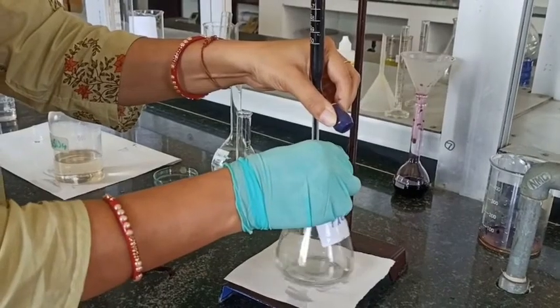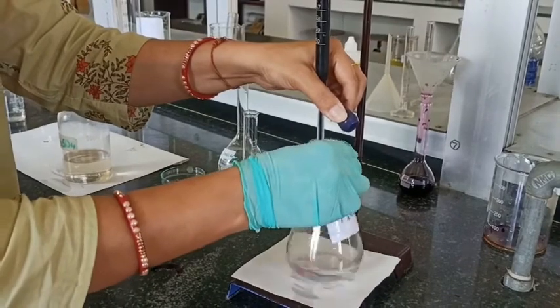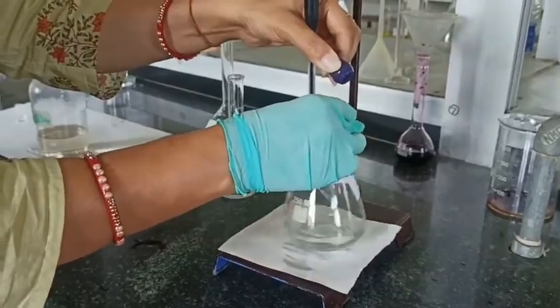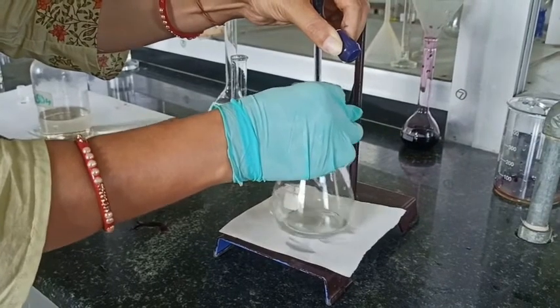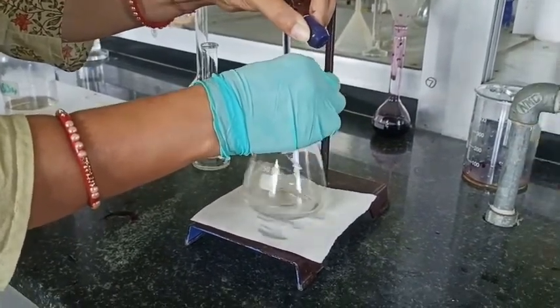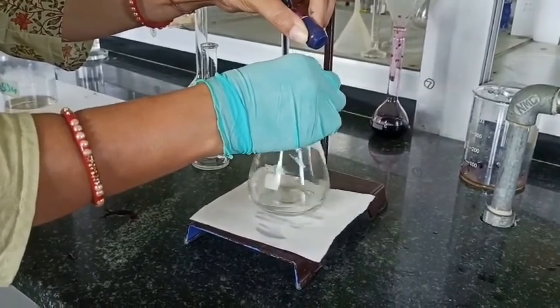Initially, what you have seen here, I'll just explain. In the conical flask we have oxalic acid. That is, oxalic acid is present in the conical flask. The color of the KMnO4 disappears because MnSO4 is colorless. The titration is going on, and still oxalic acid is present inside this.